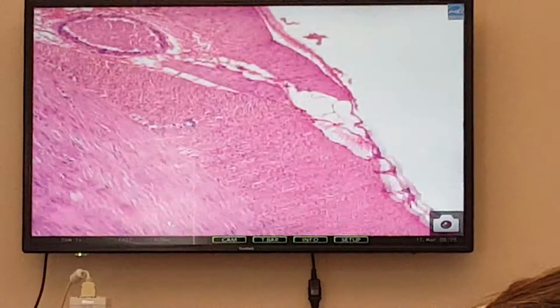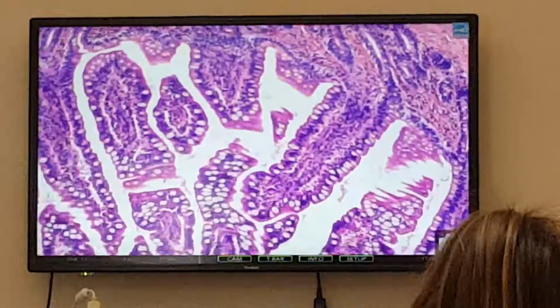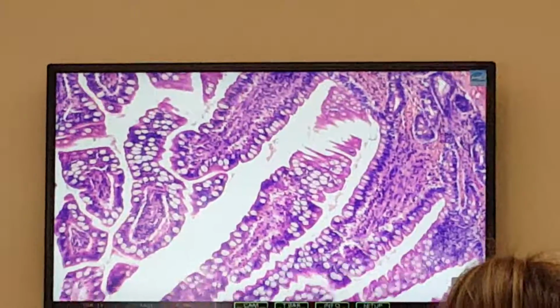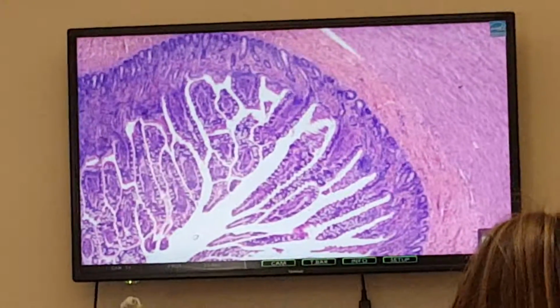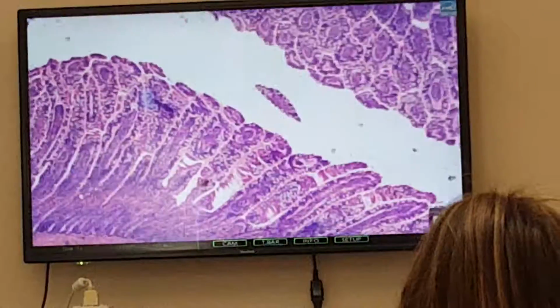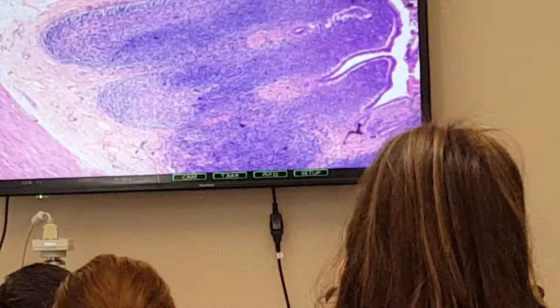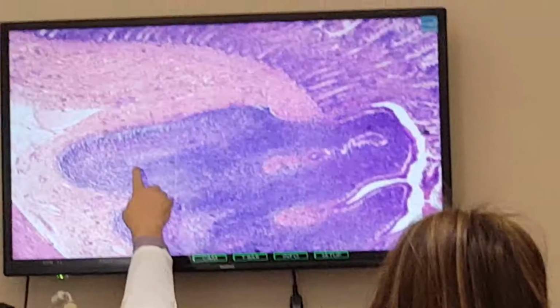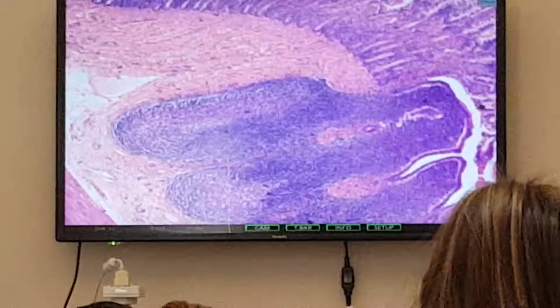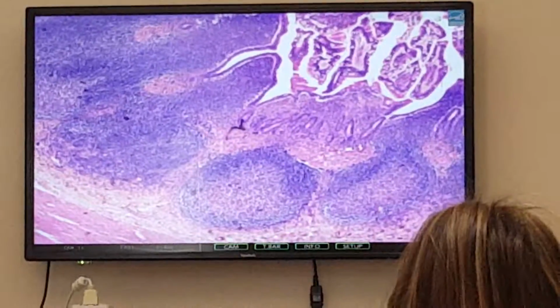All right, so then let's go further. Here's another part of the small intestine. Okay, again, some of these villi are broken down because of plane of section, not catching the entire structure. Well, look here. This is within the submucosa. You're finding here's a lymph follicle, here's a lymph follicle. Okay, some of these lymph follicles are extending up toward the surface. You see these? Ileum.